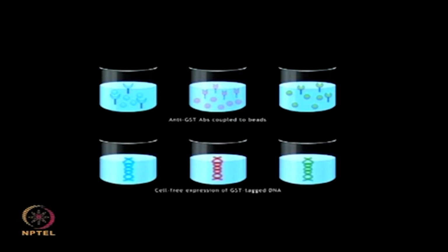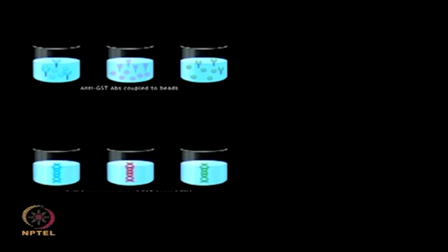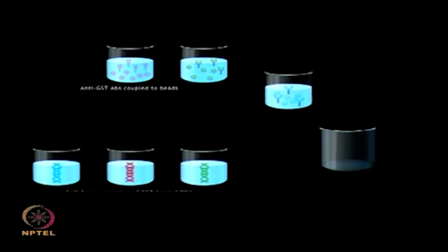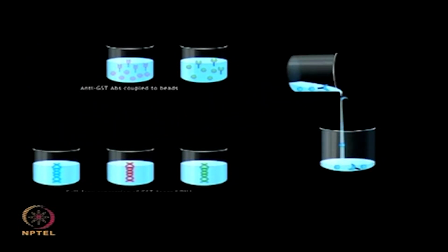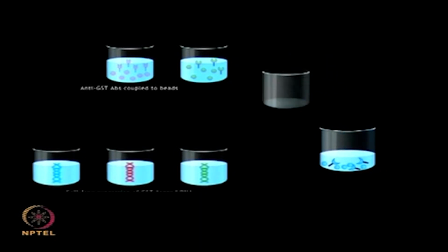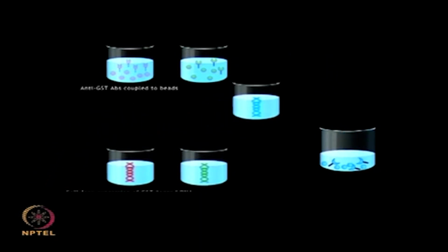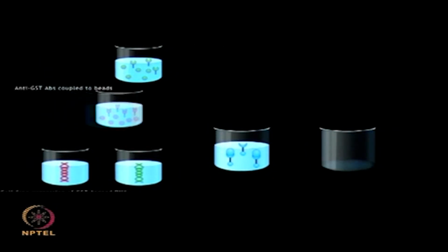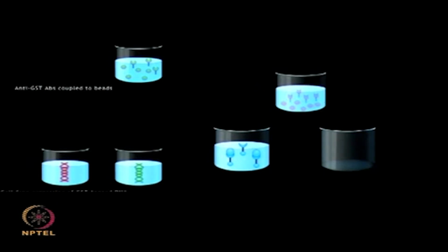In this study, the authors developed a programmable multiplexed immunoassay where tagged antigens were expressed by using in vitro transcription and translation, and captured these onto the anti-tag coated beads.